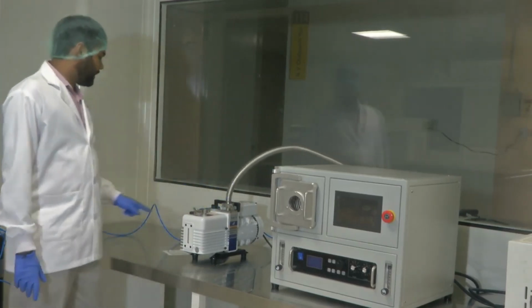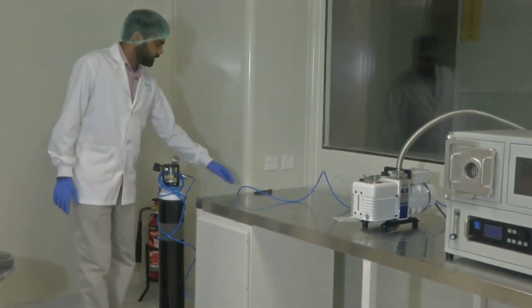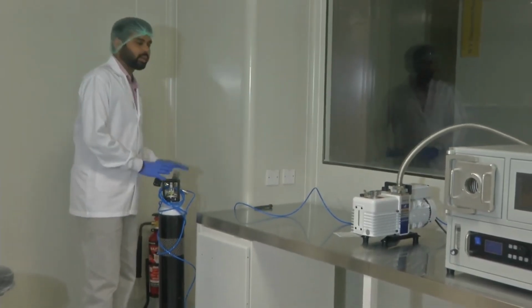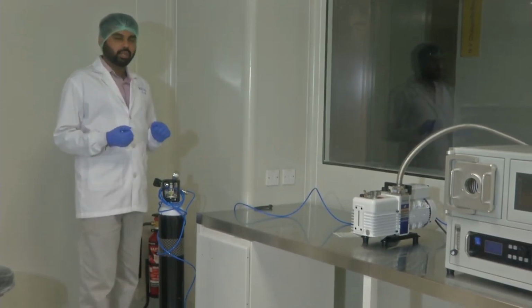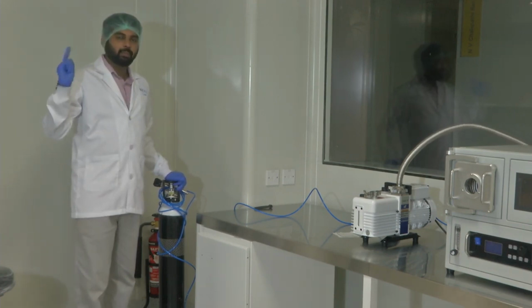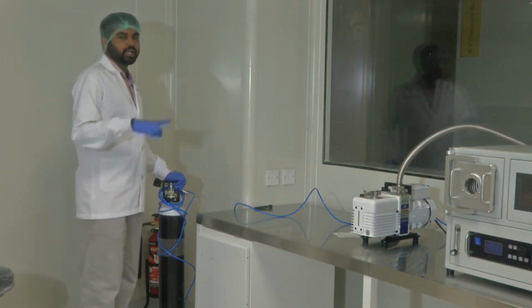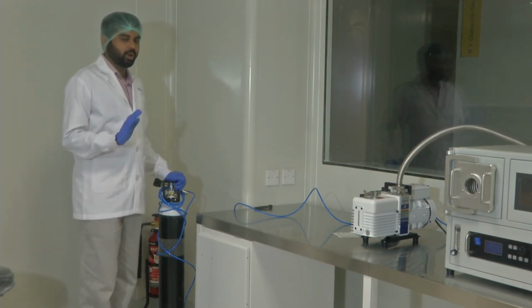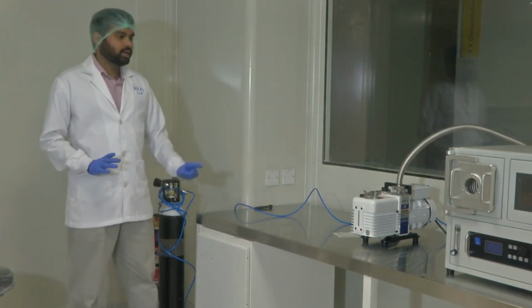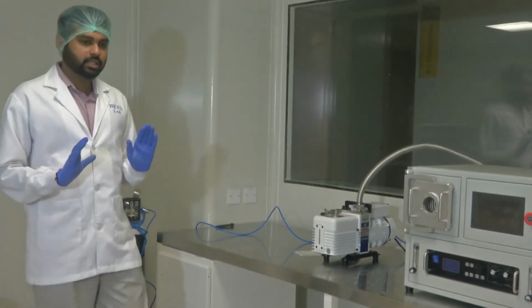Okay, and then we have the oxygen cylinder here. From here the oxygen supply goes to the main unit. For demonstrating to you, we have kept the oxygen cylinder here, but as per safety regulations, the oxygen cylinder should be kept outside the lab in a utility room, properly chained. But because we have to show you how the cylinder connection goes, we have kept it here. This is not how it should be operated. So the oxygen tube is connected there, and supply will go. Okay, so these are the three main things that are required for the system to operate.